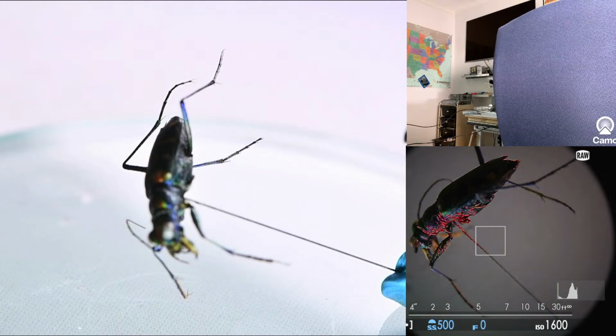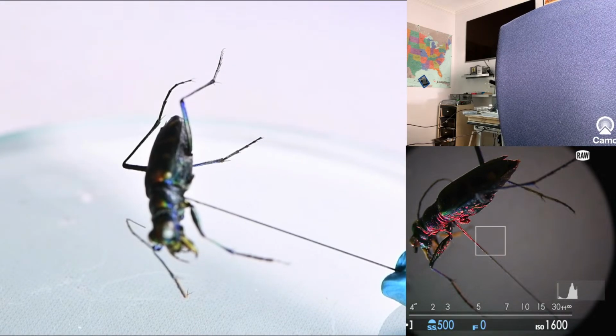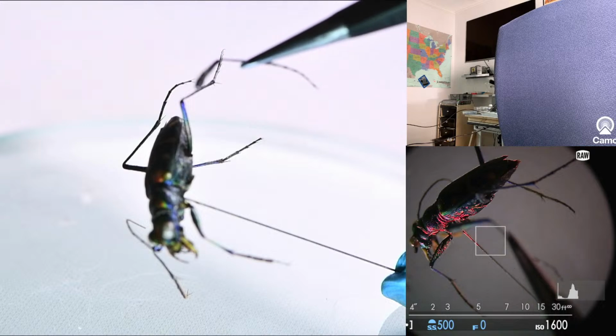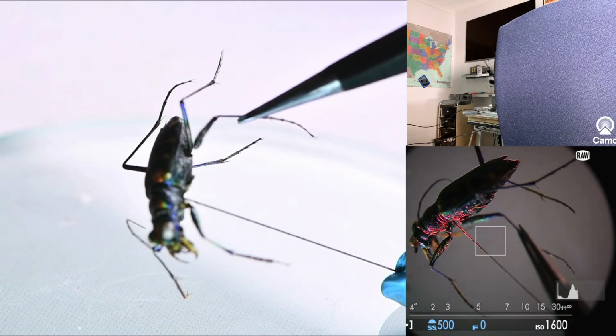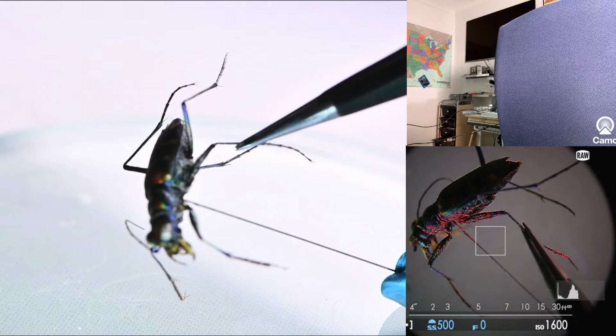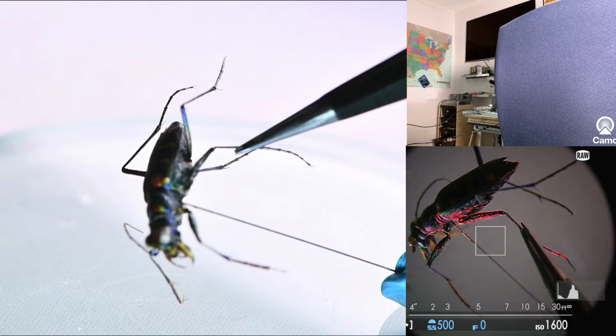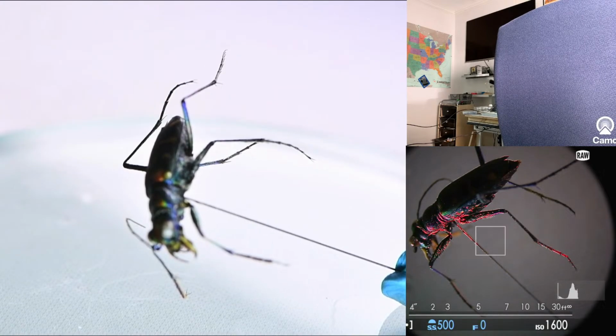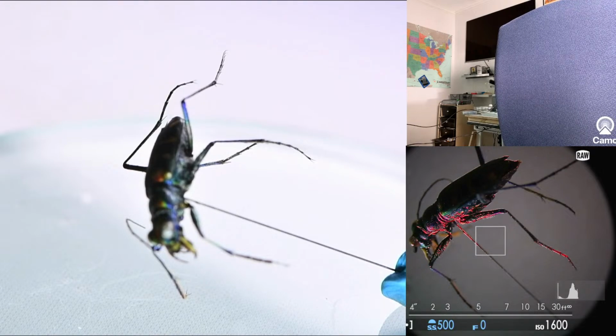Now I'm going to look through the microscope. Oh, that makes such a huge difference to be able to see. Then I'm dipping the end in just the tiniest amount of glue straight up to the body, and this is without binocular vision, so I position it right on the stump, hold it for about 2.5 seconds and release, and that will set it.